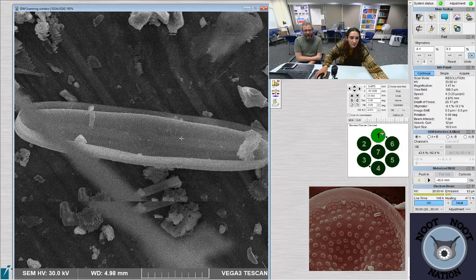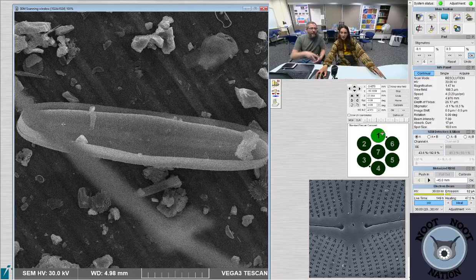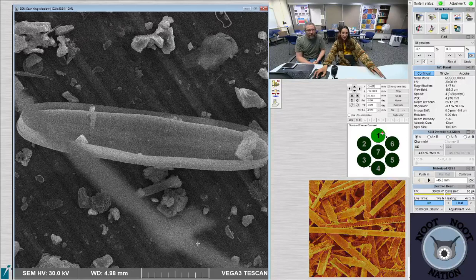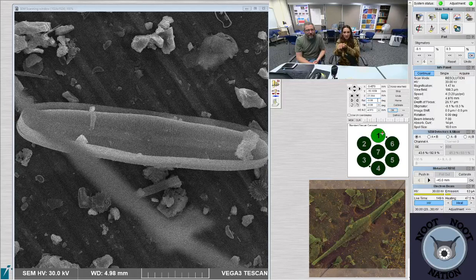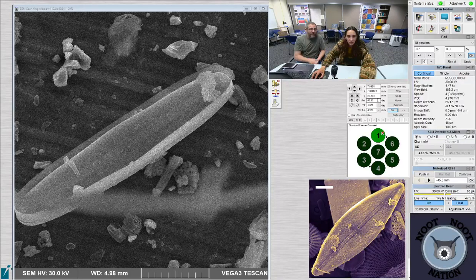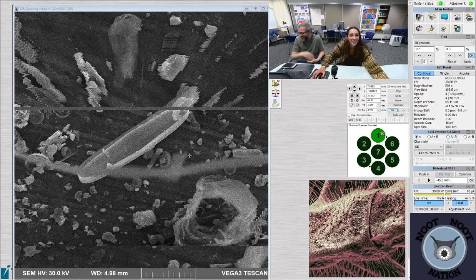This one's an Aviculo? No. That's, I think, a Pinnularia. But it's like 3D? Like, I'm seeing the girdle inside? It's pushed into the girdle band. That's the girdle band coming out at us. I wish this wasn't there. I don't think it's a good picture with this one. We probably can't rotate that out of the way. Try turning it and see if it will still be blocking it. I'm at zero and I need it like this. So like 40 degrees. Let's try it. A little more. Or less? More. I think that thing is still in the way either way. We could tilt it, but I'd have to do some things. No, we're not tilting it. Not yet.